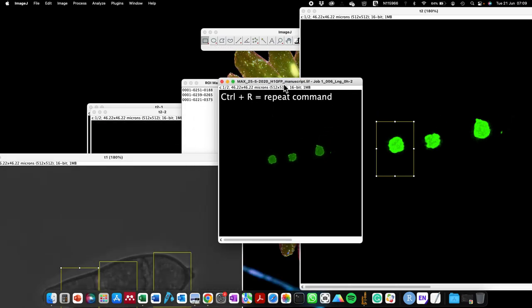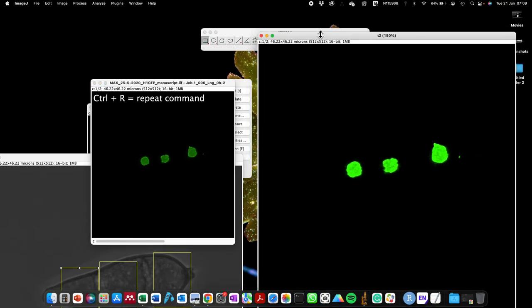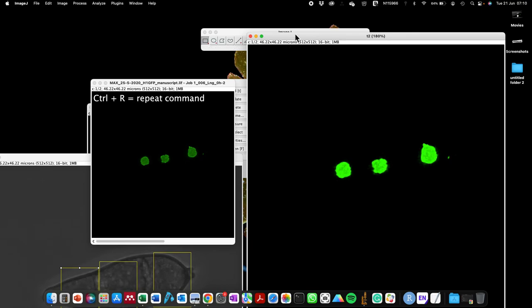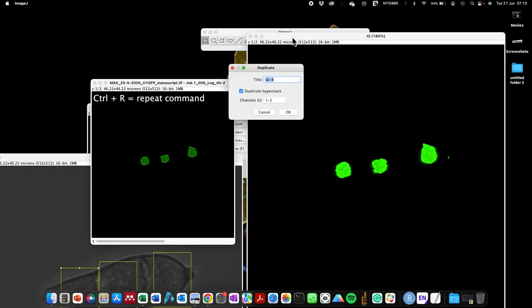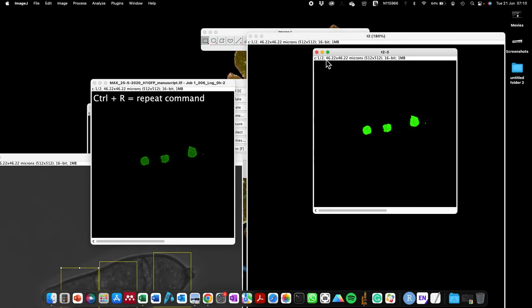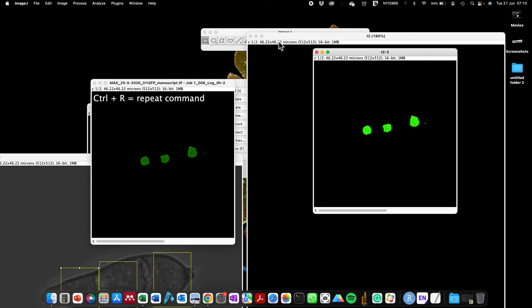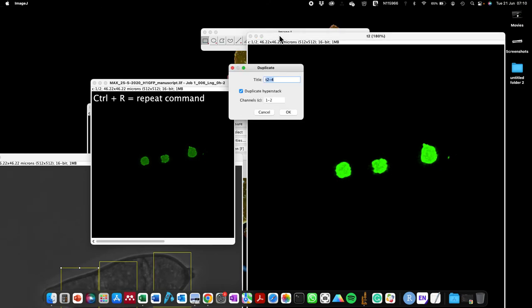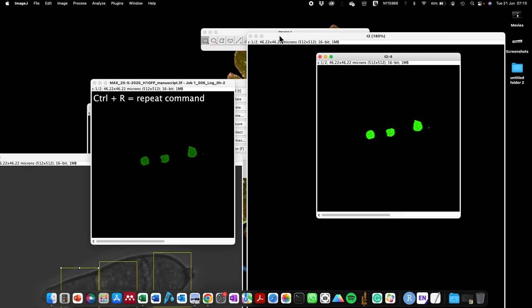I'm also going to close that. The last bit is the Repeat Command. What do I mean by repeat command? Imagine I want to duplicate this image — I press Command + Shift + D to duplicate it. Now if I want to repeat that process one more time, I just press Ctrl + R, which brings up that window again, and I can duplicate the image. So if you are working on a series of images and want to repeat the same action multiple times, just keep pressing Ctrl + R until you're finished.